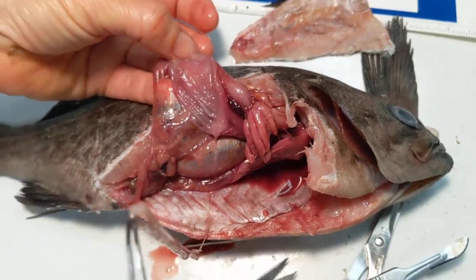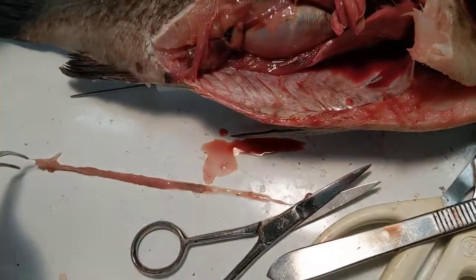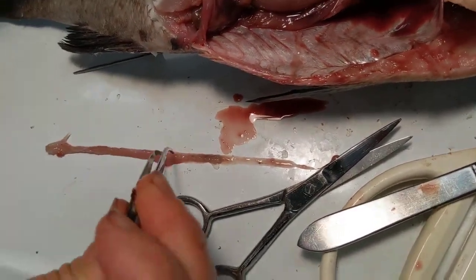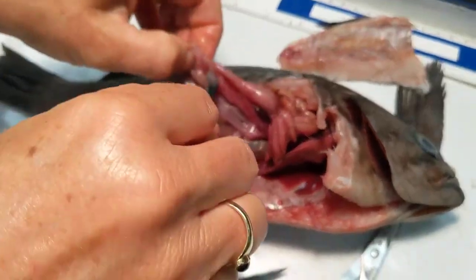A worm. So it did eat a worm. These guys are pretty omnivorous. So nothing else good in the stomach.